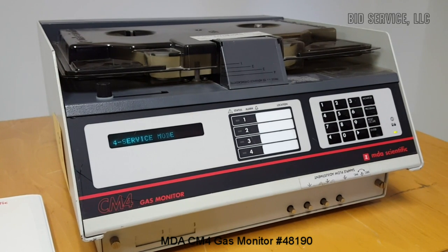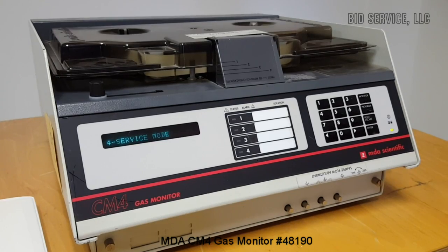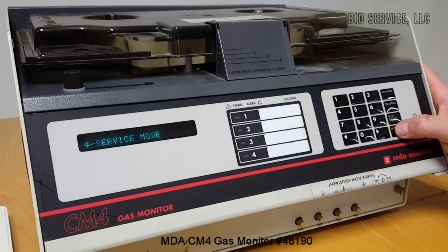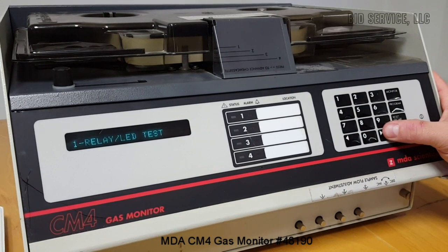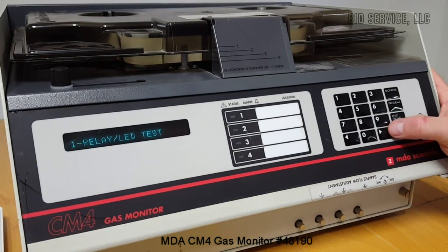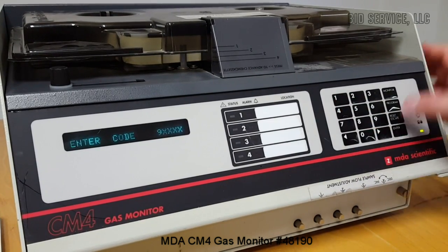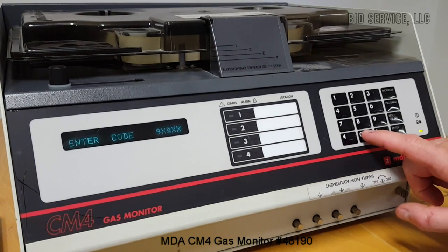This is a video demonstration on the MDA Scientific CM4 gas monitor. In service mode, you can select different tests to check the system out. The password is 9000.